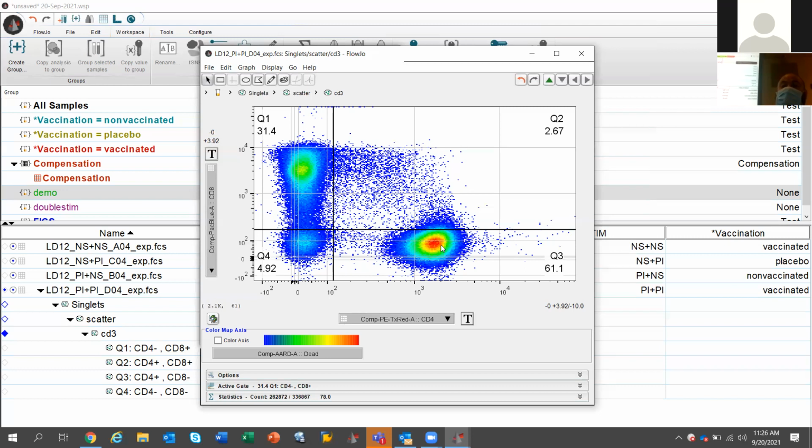This should have been a lot tighter. So the brighter your samples are, the wider they're going to be. That's why you need to be careful about spread, because then you could be thinking that something is positive, especially if you're looking at intracellular cytokines or you're doing tetramer staining or a low expressor, like you did stimulation of something and you only see a rare few events. Also, it's an issue with rare subpopulations.